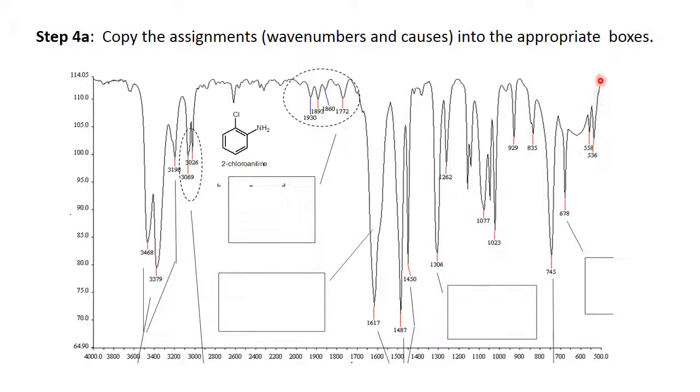Now the NH out of plane bend, recall that was between 670 and 910, is this very broad not so intense band down here. I haven't asked you to identify it but don't confuse it with one of these halogen bands or out of plane aromatic bands that we're seeing here.